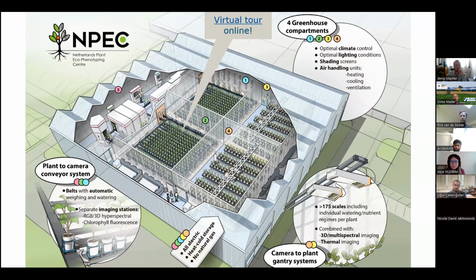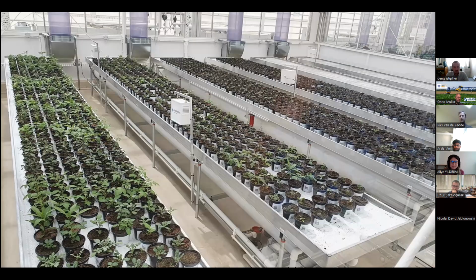Therefore, I'm going to add one more example, because often root phenotyping experiments are on drought. And that is something that we do constantly in the greenhouse, where we do not look at the roots. This is a big trial on potato. This is the control table with ebb and flood. They are receiving water. So we pump water on the table, so all pots get an even amount of water. This is the treatment table.